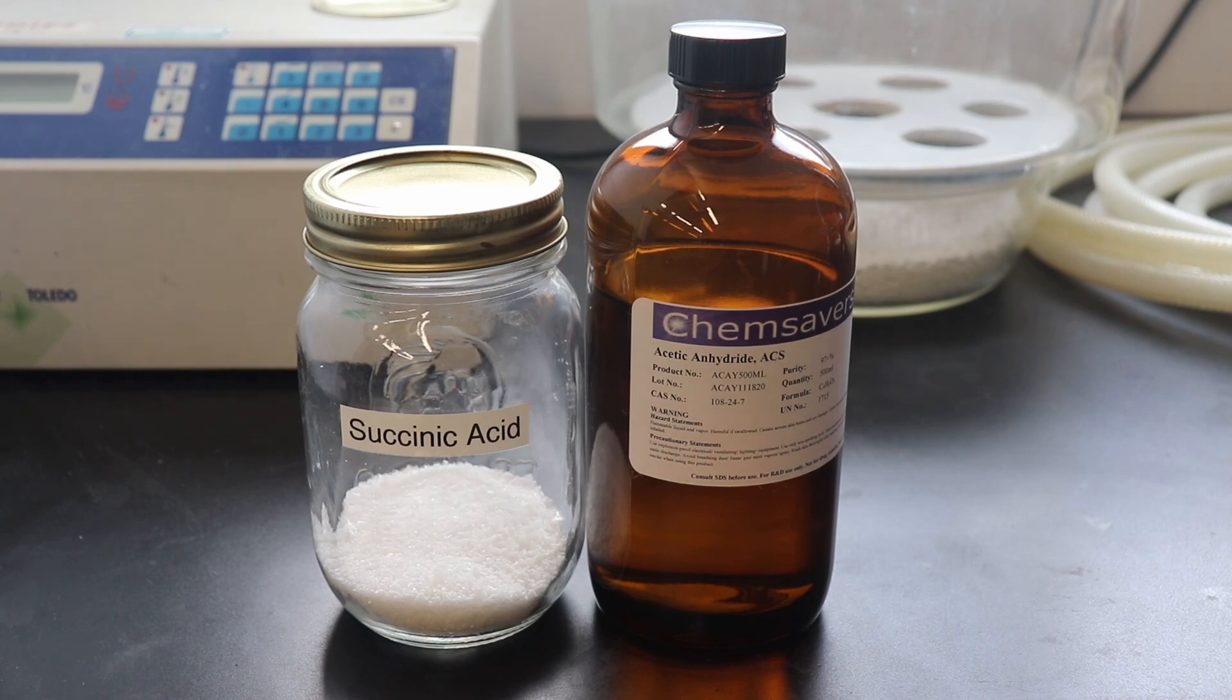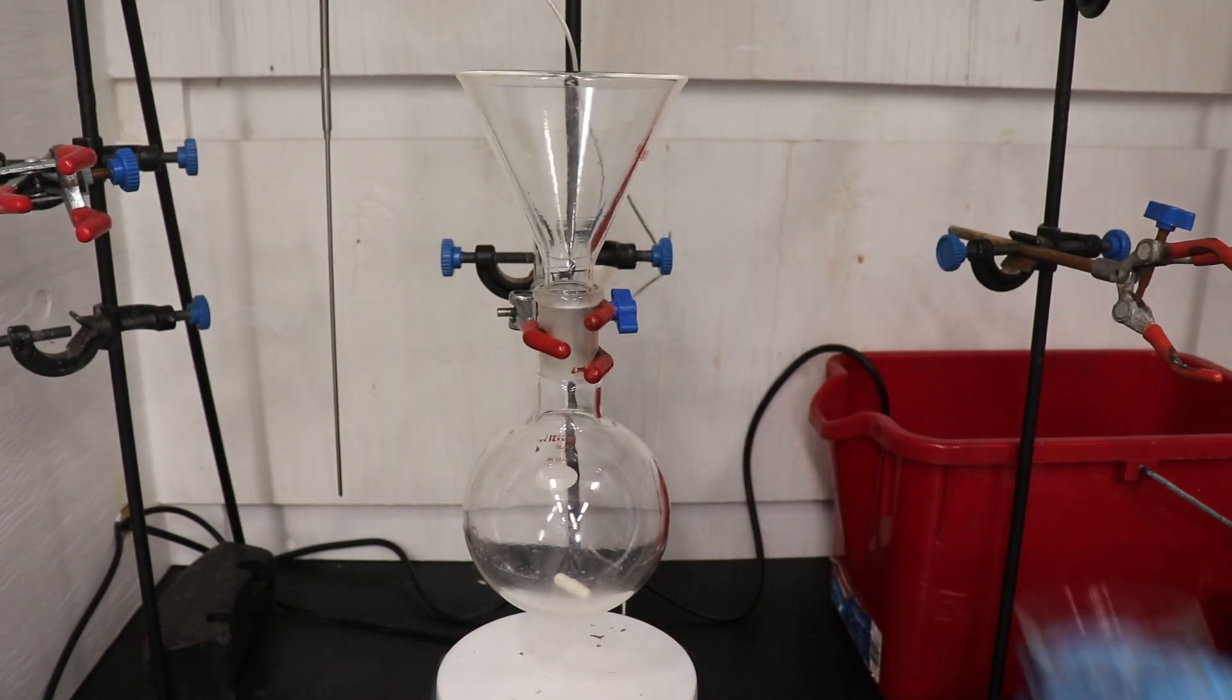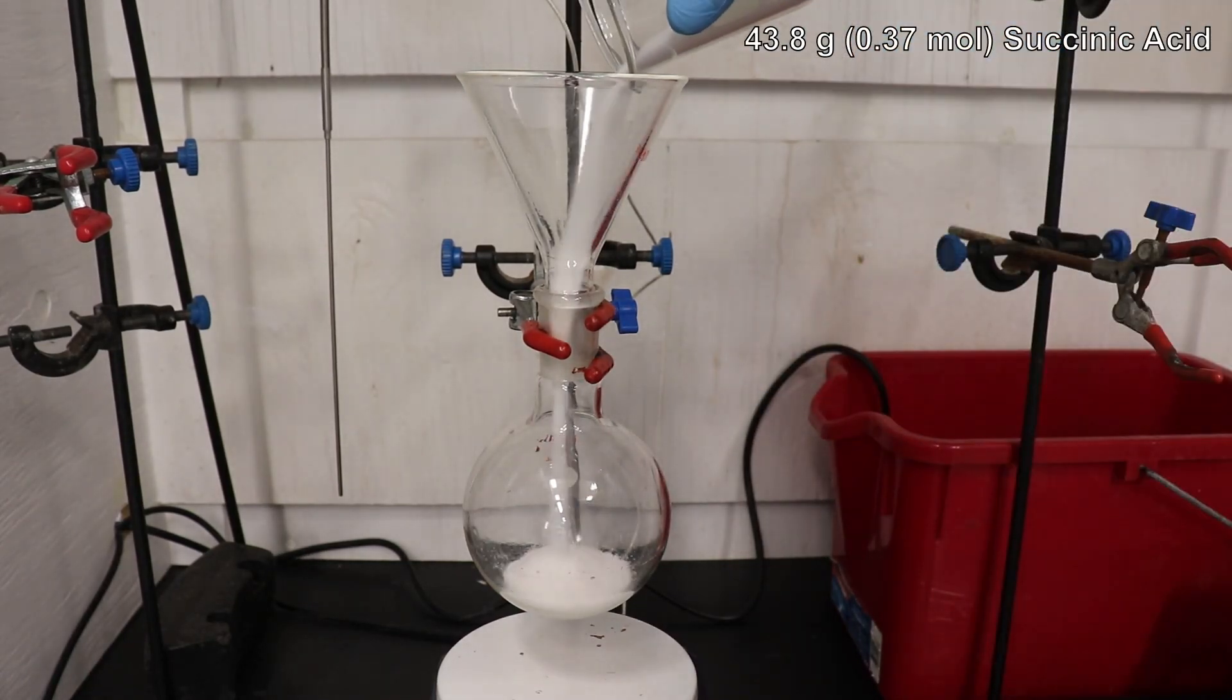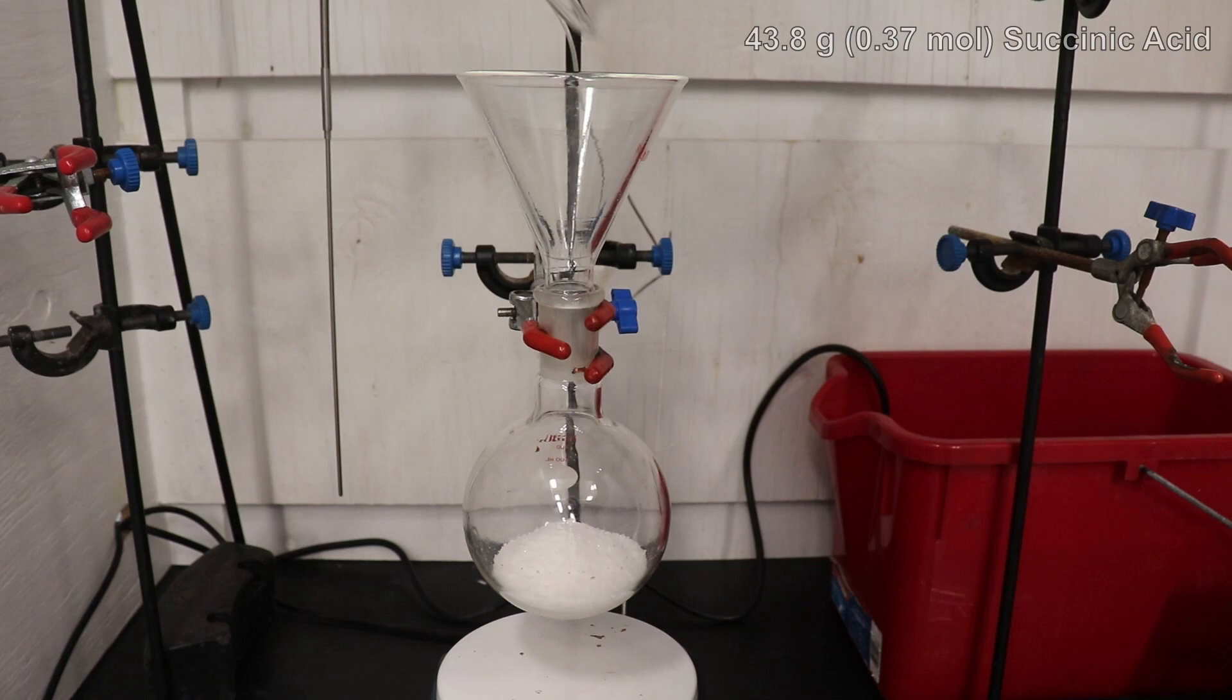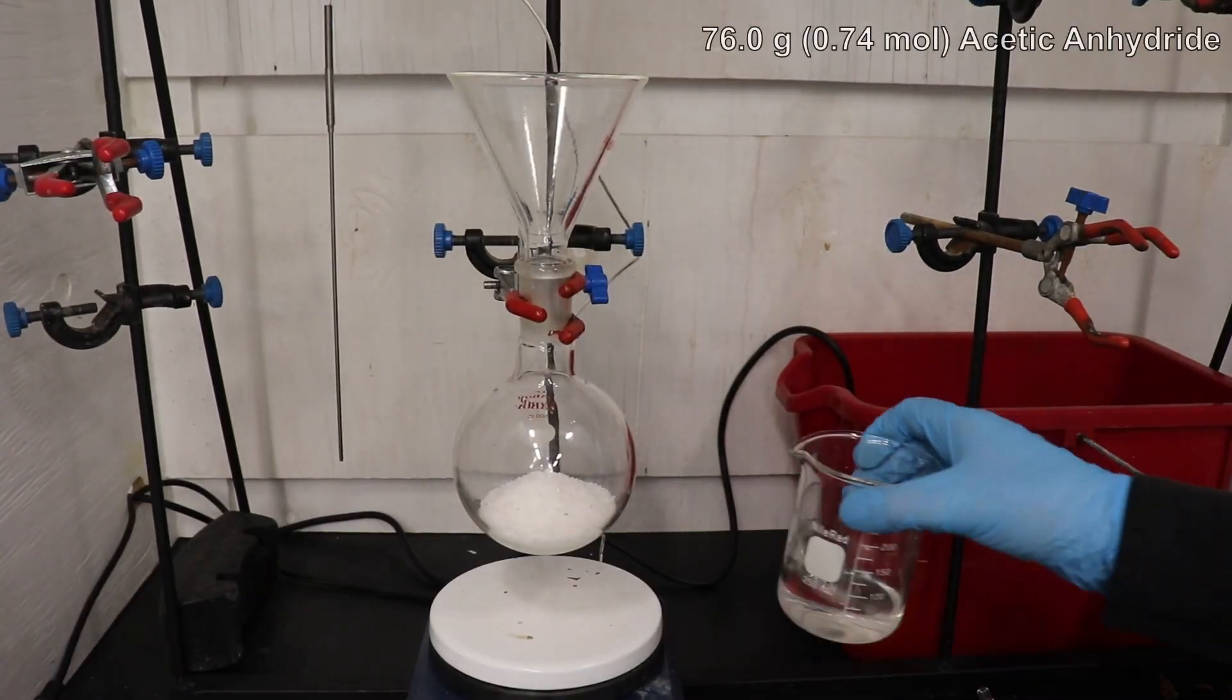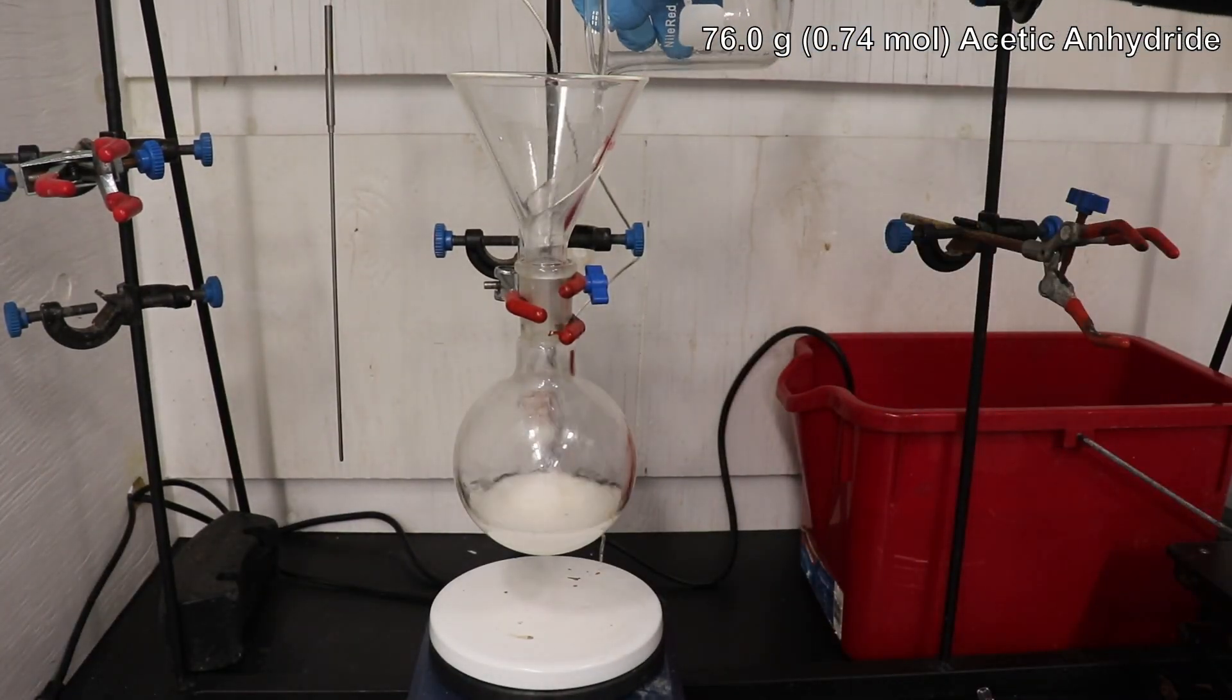Though I will discuss some other ways of dehydrating succinic acid later in the video. To begin, 43.8 grams of succinic acid was loaded into a 500 ml round-bottom flask. This was followed by the addition of 76 grams of acetic anhydride.